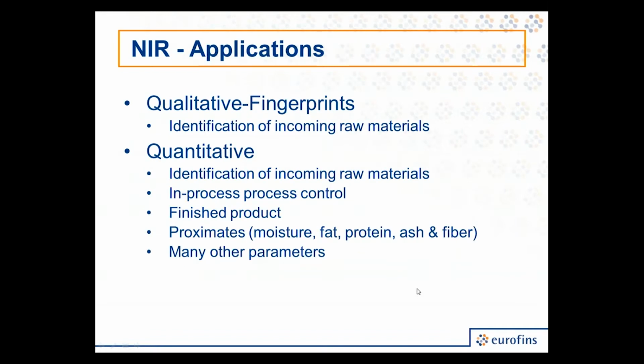Okay, Sarah, you can move to the next slide. Applications to consider for near-infrared spectroscopy vary by industry and can be custom designed to suit different companies and the specific products and needs. Both qualitative and quantitative, or specific ingredient concentrations, can be analyzed based on their importance in your specific process.